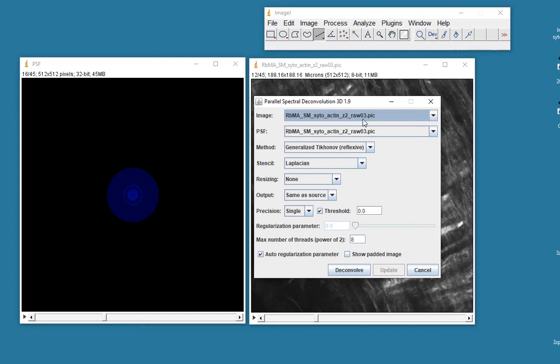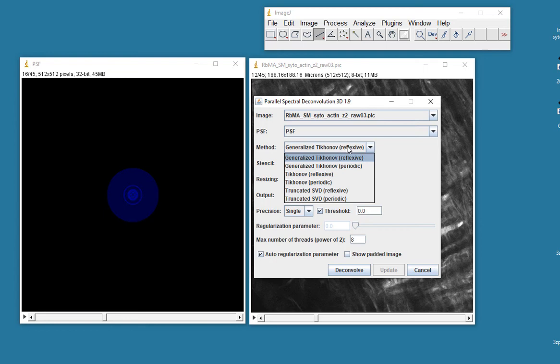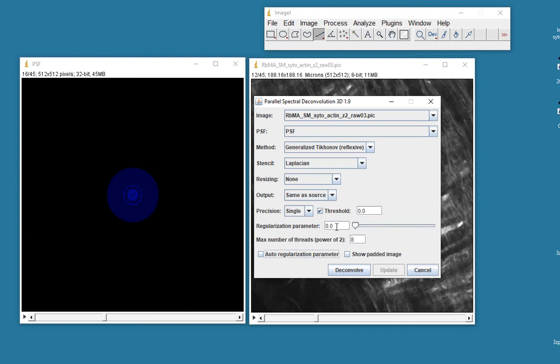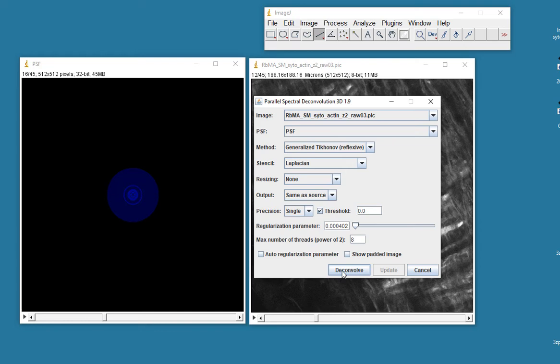Okay, my image is .raw03.pic, so it's that dataset. My point spread function is this one called PSF. And here I have a choice of different types of methods. And actually, this one might work okay. I think this one works better. Let's try both of them. The generalized Tikhonov reflexive. We don't want to auto-regularize. I'm going to use here a parameter of 0.000402. For no reason other than I have found this to be a particularly effective number. Let's just deconvolve this and see how it looks.